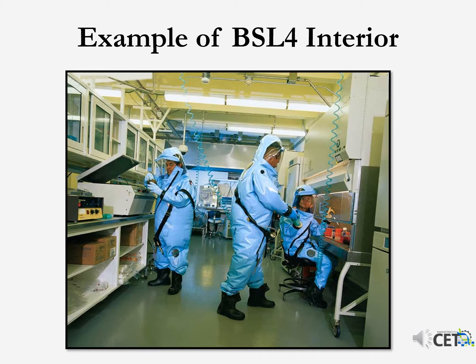This is a picture of the interior of a BSL-4 lab. A BSL-4 is where the very most serious organisms are used. Those are the microorganisms that, if you become infected with them, there is no cure and no treatment. They are very likely to be lethal.